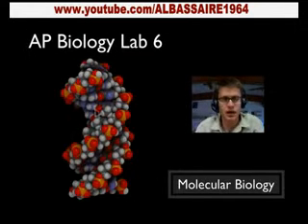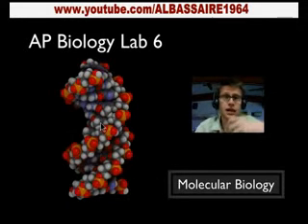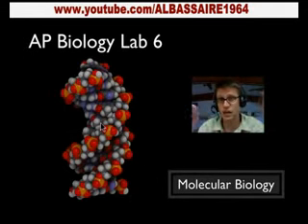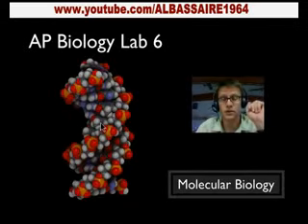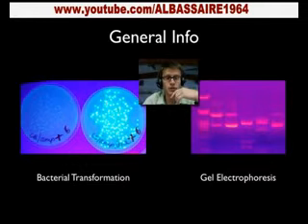You can see right here we've got DNA, and that DNA, we're going to do two things with it. First of all, we're going to do what's called bacterial transformation, and what we're going to do in that is try to put the DNA actually inside a bacteria. And the other one that we're going to do is gel electrophoresis, and so we're going to take a section of DNA and then cut it into different fragment lengths and then separate those. And so let's go to the first one, bacterial transformation.